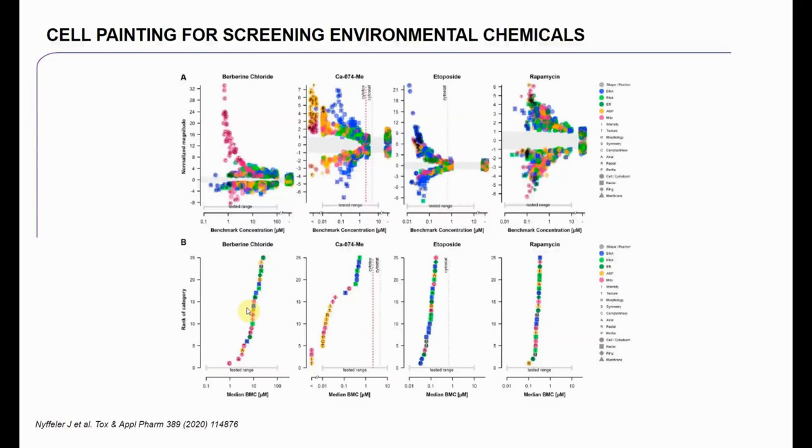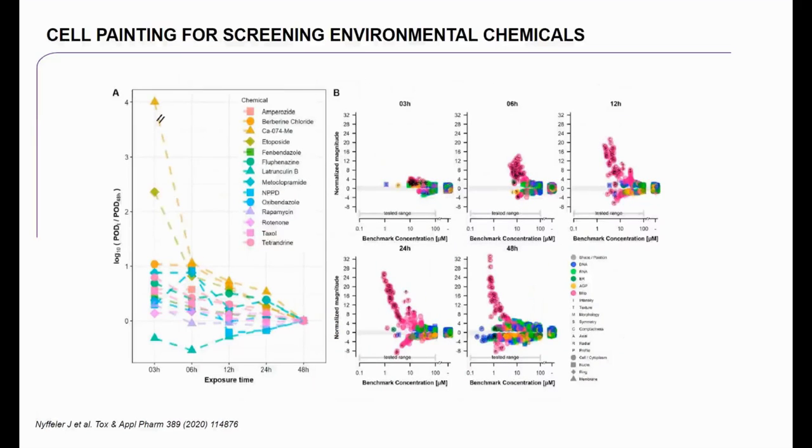And then you can compare that with the results from the cell viability assay, and then come up with your HTPP POD, point of departure. And so essentially this is what it's telling you, is at what concentration are you starting to get some sort of effect from a chemical, either through the cell viability assay or the cell painting assay. And then compounds that have a very low point of departure are things that you probably should be worried about. As usual, pre-incubation is an issue.